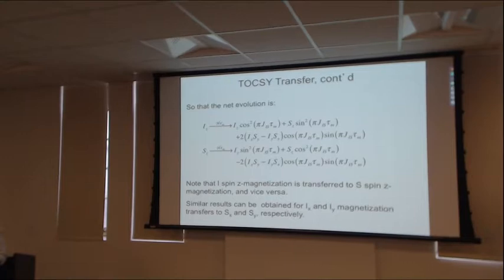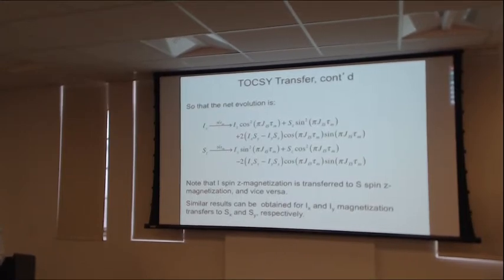And in the COSY experiment, as the molecule gets larger and the line width grows, the positive and negative lobes of the antiphase signals start to overlap and cancel each other, which is why the COSY stops working when you go to a larger molecule. But here, the signal is in phase, so one can expect this to work on larger molecules, which is a pretty good thing.